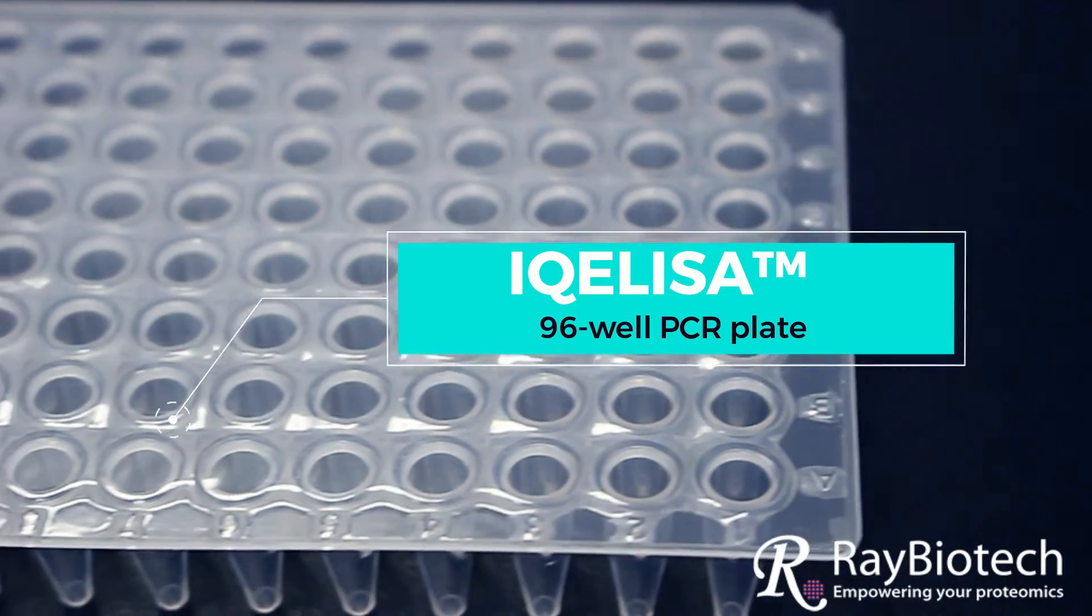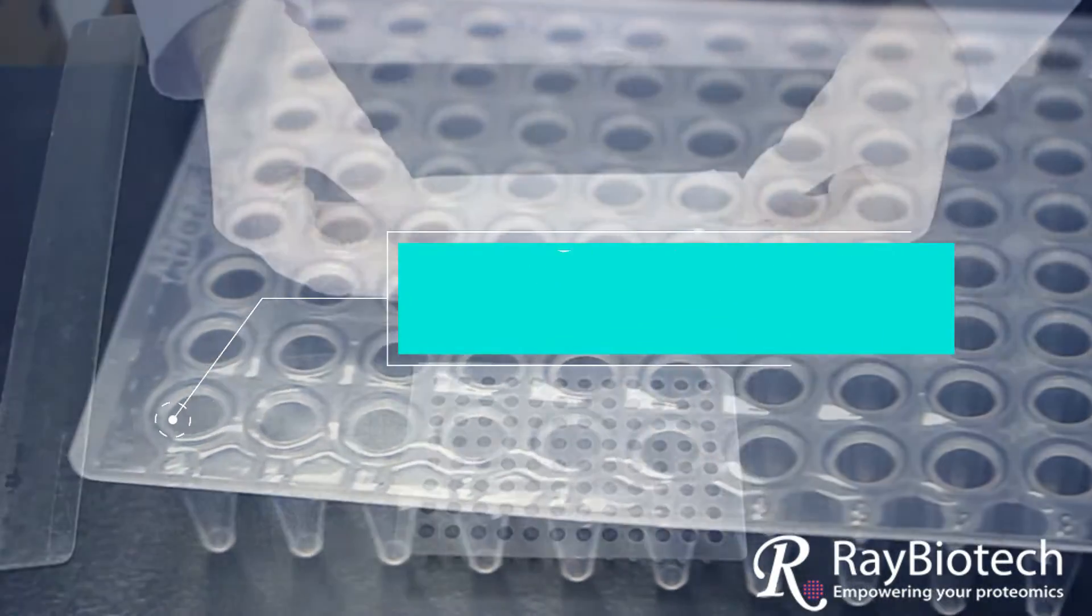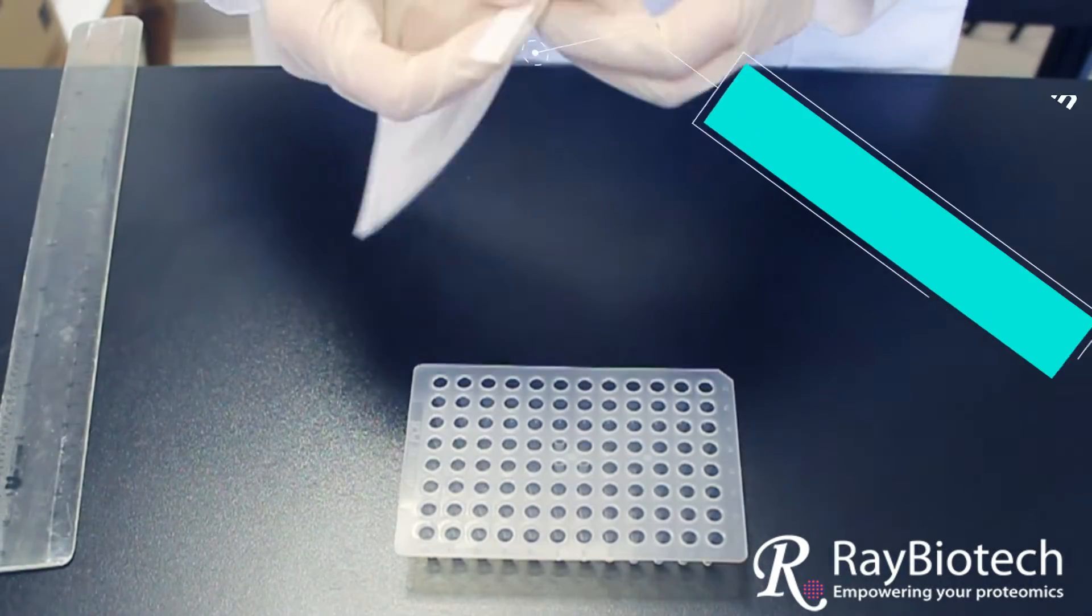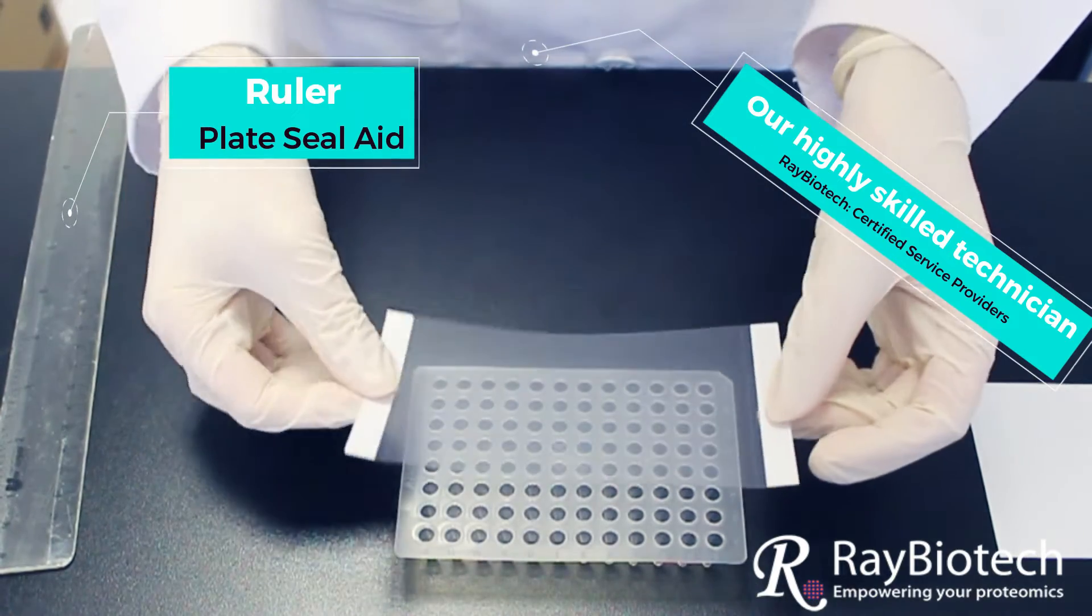The last step on the IQ ELISA is ensuring a proper plate seal. To seal the plate, place the plate film on top of the plate and grab a flat edge. We like to use a thin, lightweight ruler.